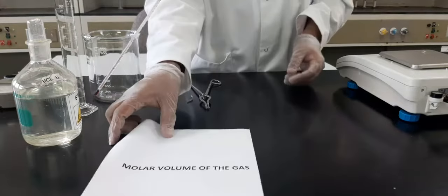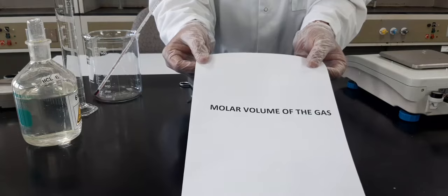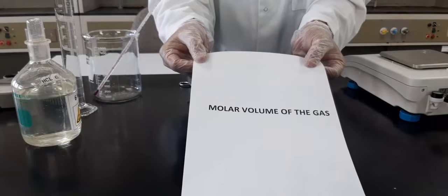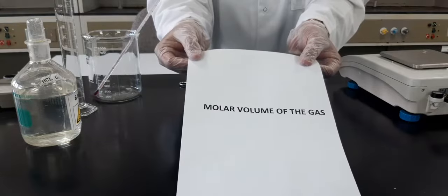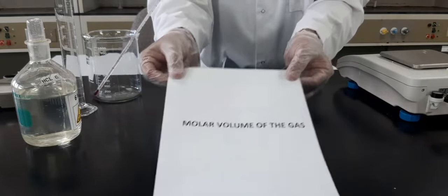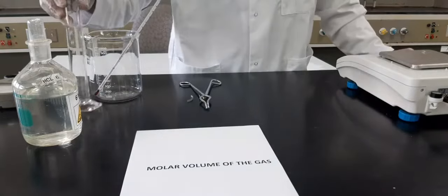Okay, so if you are having molar volume of a gas in your exam, this is how you will perform it. You need to find out the molar volume of a gas at STP. You write two main objectives, then let's see the apparatus.